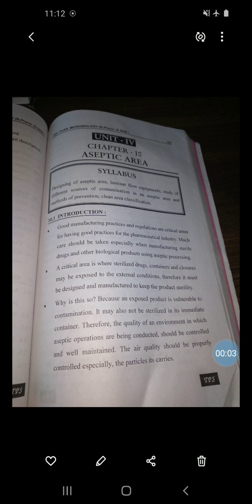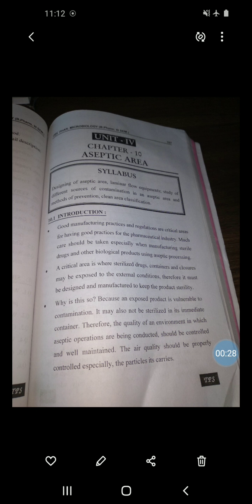Good afternoon. In the last lecture, I discussed the cultivation and also the tissue culture. Today we will start Unit 4, where we will see the designing of aseptic area and laminar airflow or laminar flow equipment. So, first we will see the introduction.